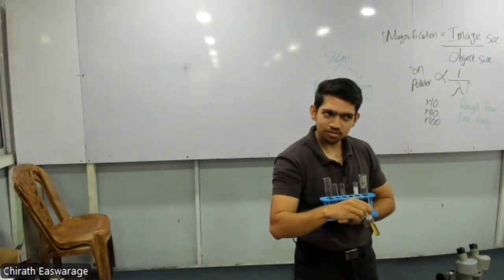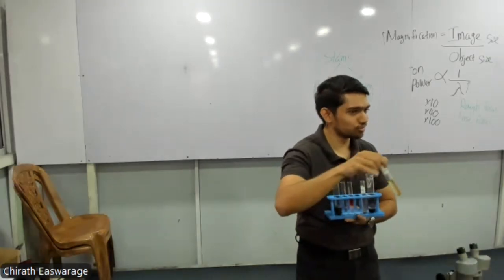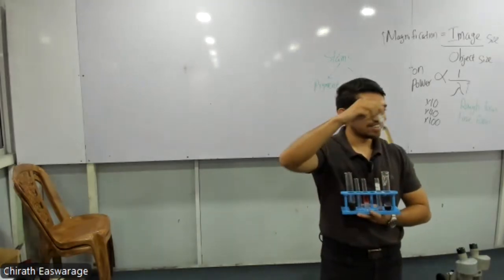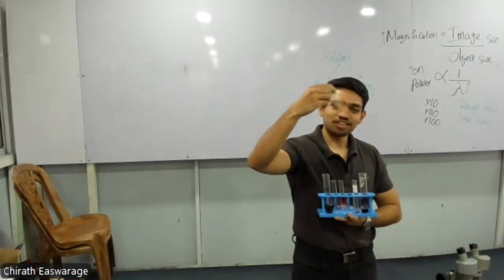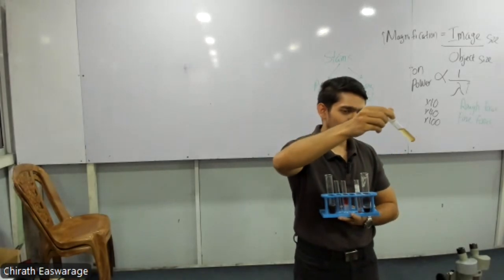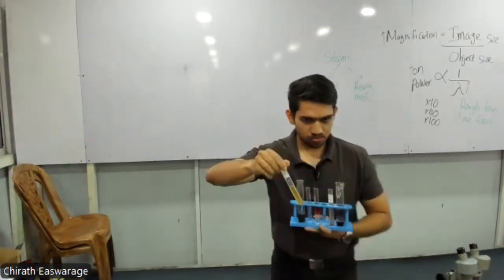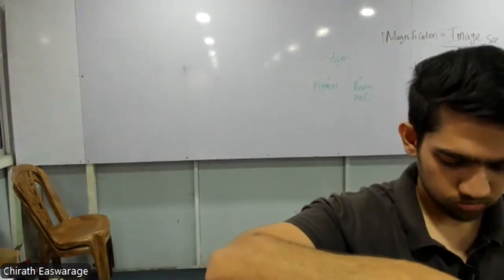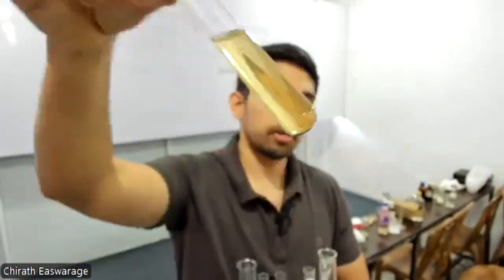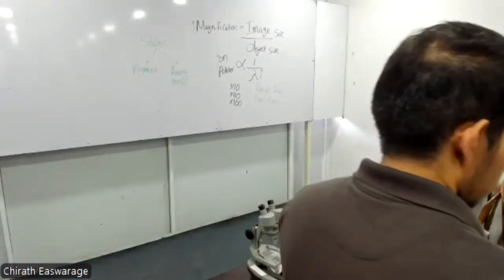Cupric, right? Plus whatever, Cu2O. I'm not a chemistry teacher. Okay, Cu2O. This is the precipitate, right? That has nicely settled, right? So can you see? The solution color decreases when the precipitate forms. Online people, can you see? Brick red precipitate underneath.